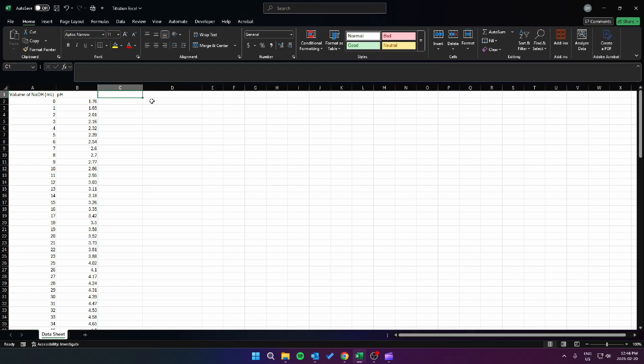Today in this video we are going to discuss how to take data from a titration experiment, make a titration curve, and estimate the equivalence point on that titration curve. So the first step is to open up Excel, and hopefully you should have collected some data on your titration. We've got two columns here.